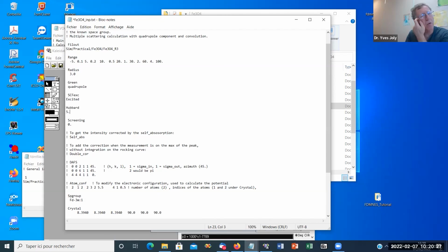In fact, I nearly explained everything you can do to improve the simulation, I think. It's due to the fact that there are some parameters like U-bar, some different ways to make the calculation, because we have to mimic multi-electronic phenomena with a one-electron code. But anyway, it's nearly an ab initio code, so there are not many ways to modify the calculations. After, you can move the atoms, of course, but that problem of structure is different.